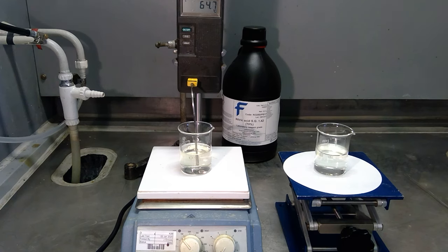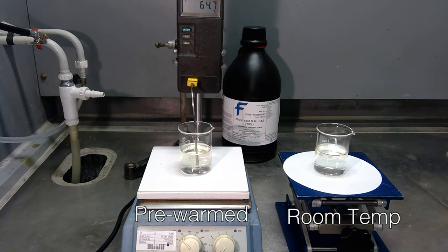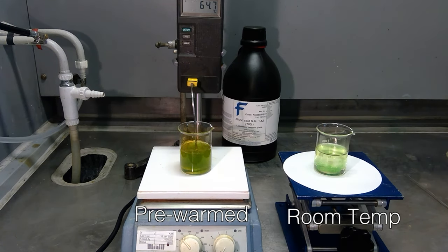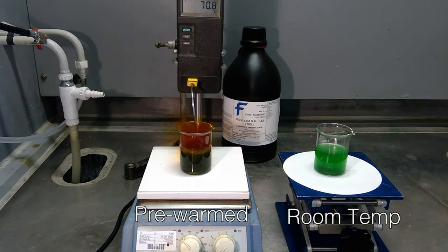What we decided to do was, this was long after Brady had left Nottingham, I persuaded Neil to do a control experiment, where he did two reactions side by side, with exactly the same amount of concentrated nitric acid, but one starting at 50 degrees centigrade and the other at room temperature. When he dropped in the coins simultaneously, there was a modest reaction from the cold nitric acid, but the hot nitric acid really bubbled away very vigorously, and the temperature nearly doubled, went from 50 degrees to nearly 100 degrees. I think it was 96.